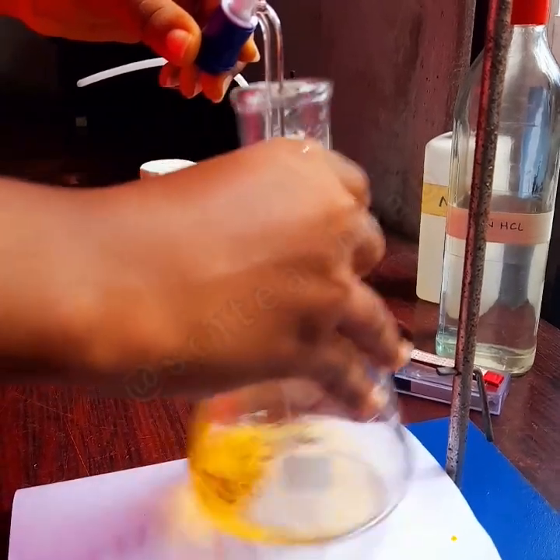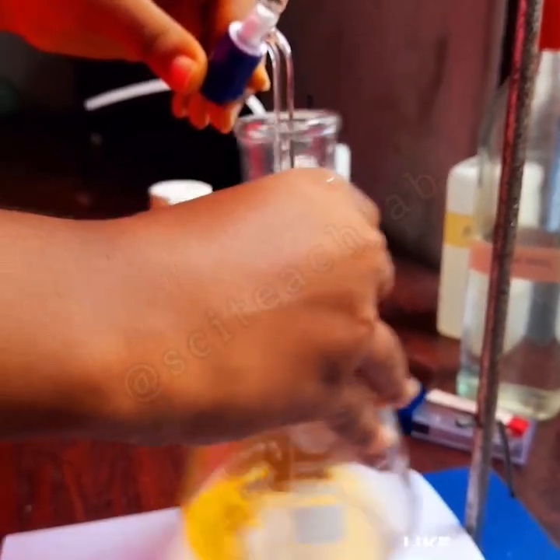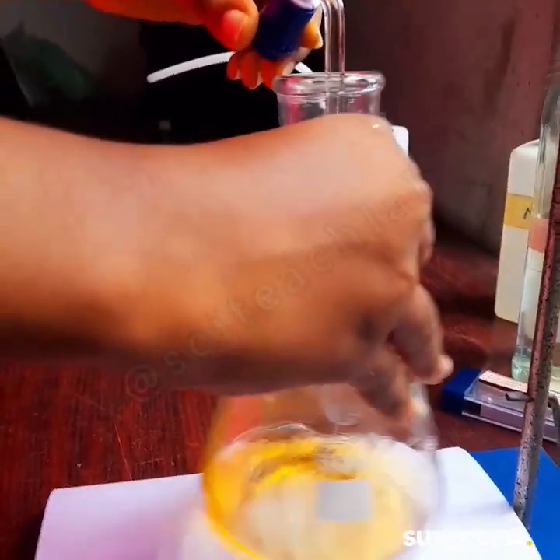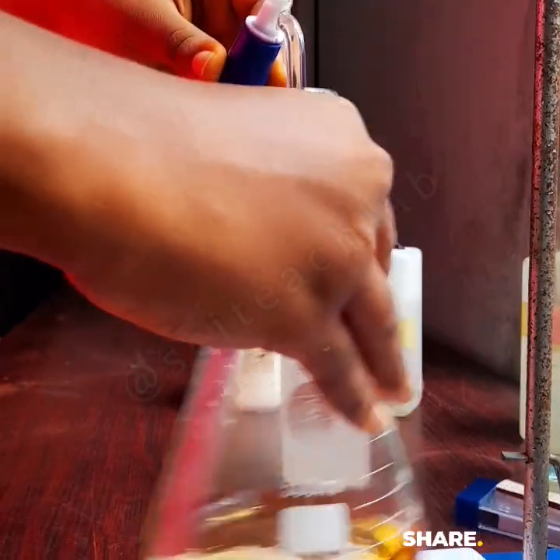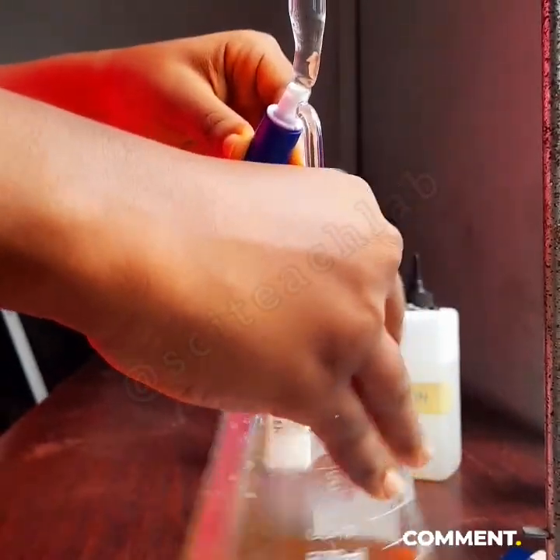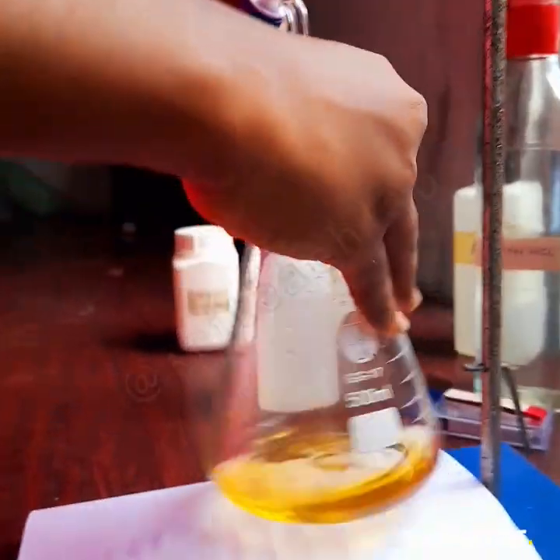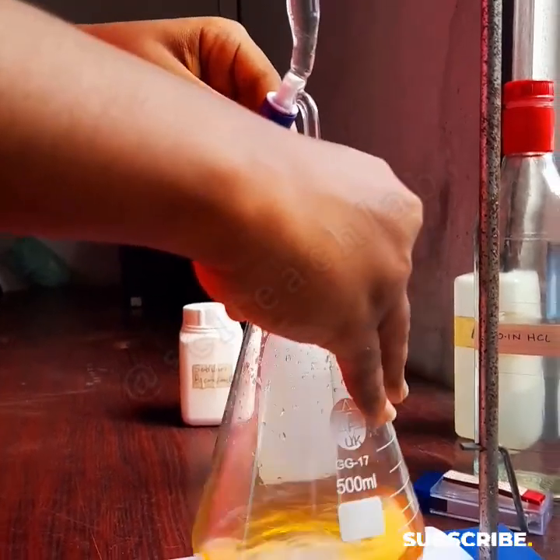So you see it's orange now, and I'm titrating, dropping the acid into the base slowly. Depending on the concentration of the acid, the end point would have been reached by now if the acid concentration was high, but it's not that high, so the volume of acid has to be more than it would be if it was more concentrated for me to be able to reach the endpoint. So you keep dropping with patience and swirling.